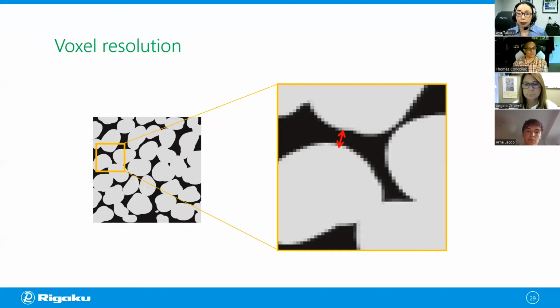So for that particular throat, we probably have more than 10 dark voxels representing that throat. So that one looks good. But this throat is very narrow, and there are probably barely 1 or 2 dark voxels representing that throat. That might not be enough voxels to see that throat accurately.